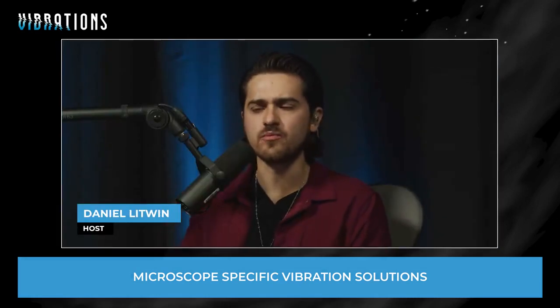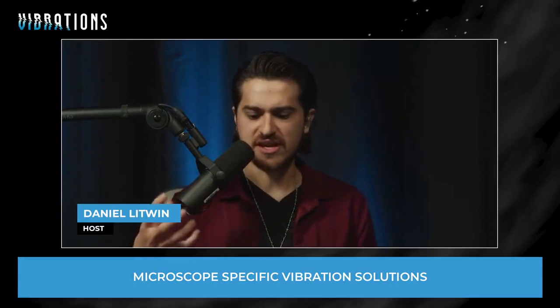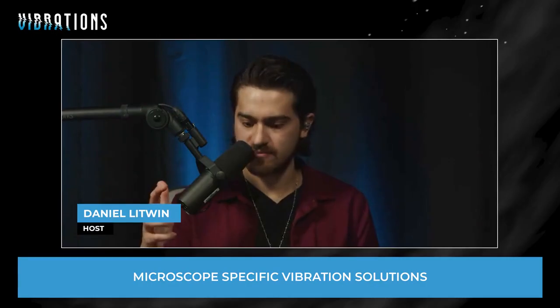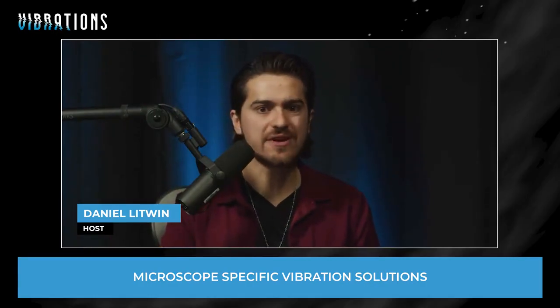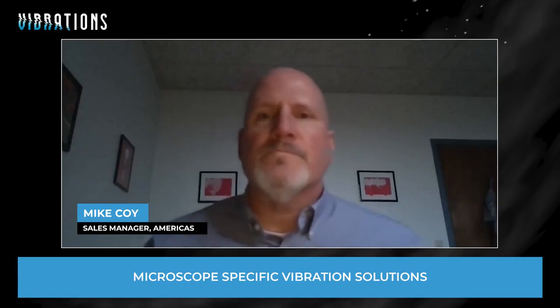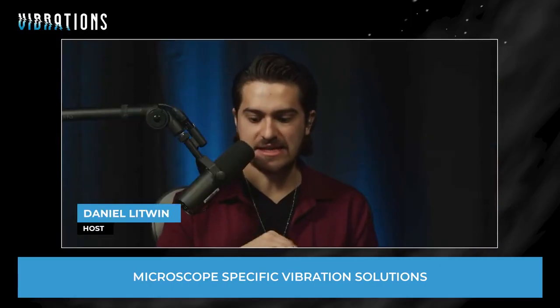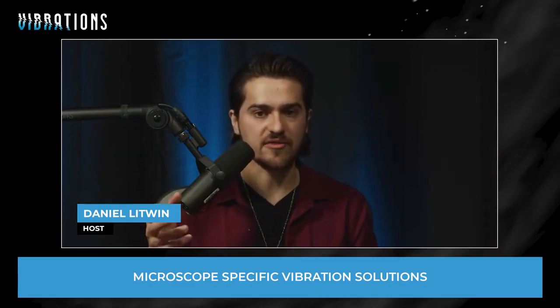Mike, from selling and curating the right solutions into typical lab environments, are there any other considerations you've guided your clients on when helping them decide on the right vibration isolation solution? If we're talking ergonomics, height, ease of installation, some of the dynamics typical in a lab environment.